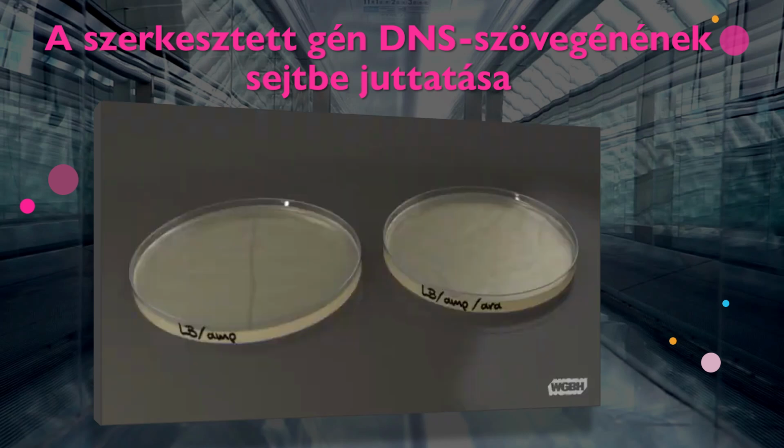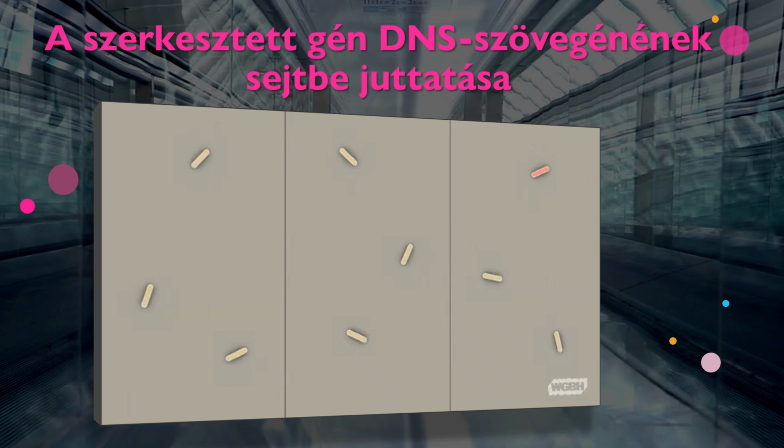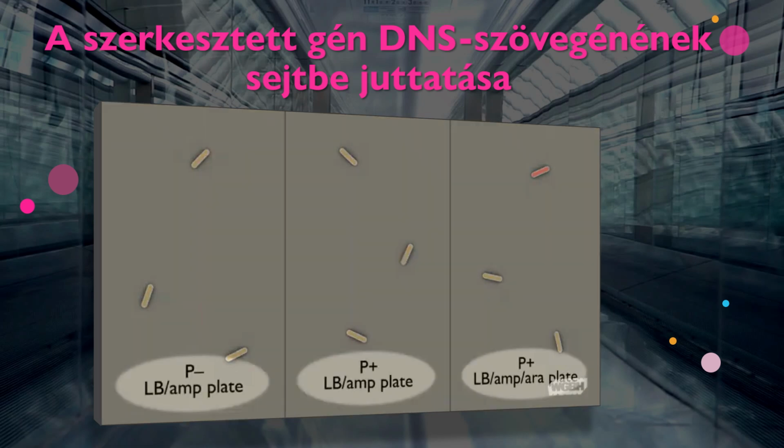Bacterial samples are now put on agar plates to test for successful transformations. The plate on the left contains the antibiotic ampicillin alone, and the plate on the right contains ampicillin and the sugar arabinose. On the left is a negative control plate, P-, where the transformation reaction was done without any plasmid. In the middle is another negative control, where transformation was carried out with plasmids, but where the gene of interest will not be expressed since the growth medium lacks the arabinose inducer. On the right is the permissive growth condition with arabinose that will let us identify successful transformations.